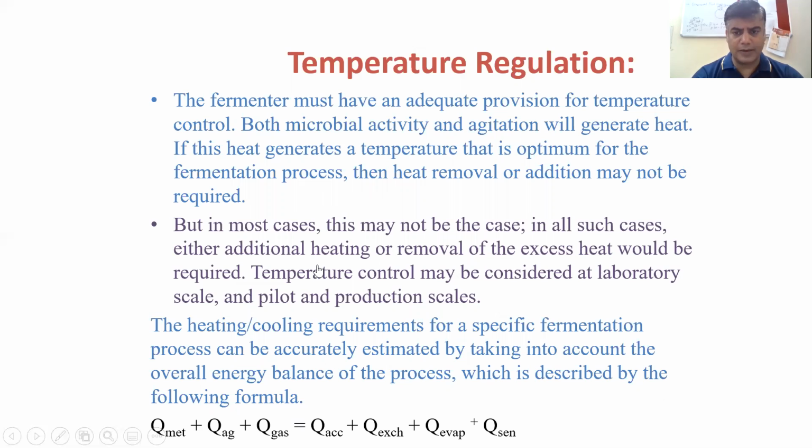Several reactions occur and heat is generated. Addition may also be part of the fermentation, and heat will be there too. So overall, we have to maintain the temperature of the fermentation to avoid any contamination, and even a blast.